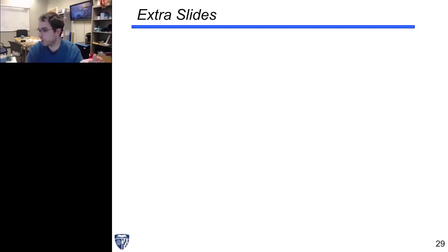If we could put in more material, or if we could get our library preparations more efficient so we could sequence from, say, a nanogram, we could do it. So I'm confident it will be possible in the future, but right now it's not yet possible.